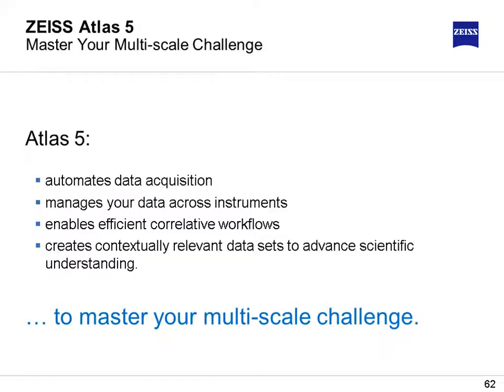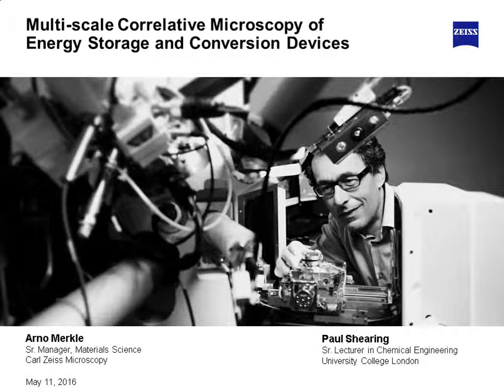Yeah, sure. So that's from Dr. Chen. Thanks for that question. Actually, once you've got that three-dimensional image, there is a huge variety of different geometrical information that you can extract, and that varies from porosity through tortuosity through to volume-specific surface areas, as well as some more subtle microstructural metrics like particle size distribution of pore necks. There's a really huge and very rich amount of information you can extract from that.